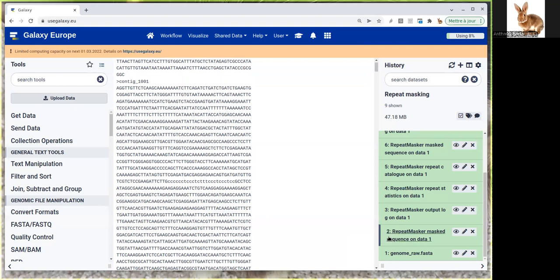That's the output, and this output can be used in the following FunAnnotate tutorial or whatever annotation tool. We can have a look at the three other outputs of RepeatMasker.